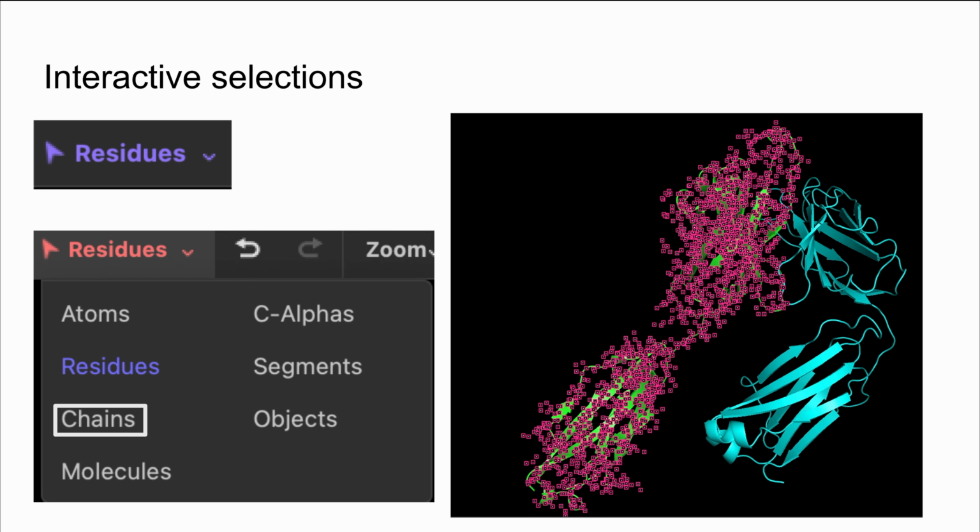The next really important thing to know is that you can grab proteins. You can change what you're selecting to either specific atoms, specific residues, specific chains, or specific molecules. If you want to move or change colors or do any kind of manipulation to a particular atom, chain, residue, etc., the best way to do it is to just grab it. You can always do this programmatically.